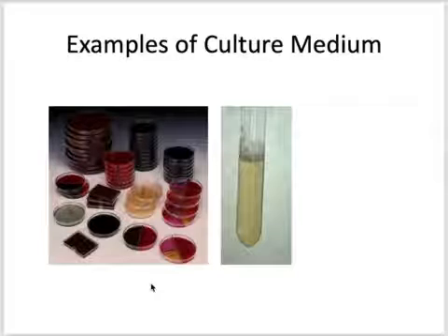This photo shows different culture media. The ones on the left are solid agar, solid culture media, and the one on the right is a liquid culture media. It is called broth. Broth means liquid.